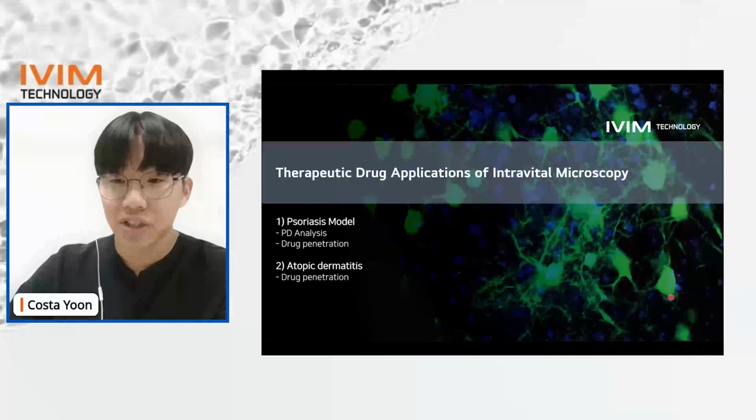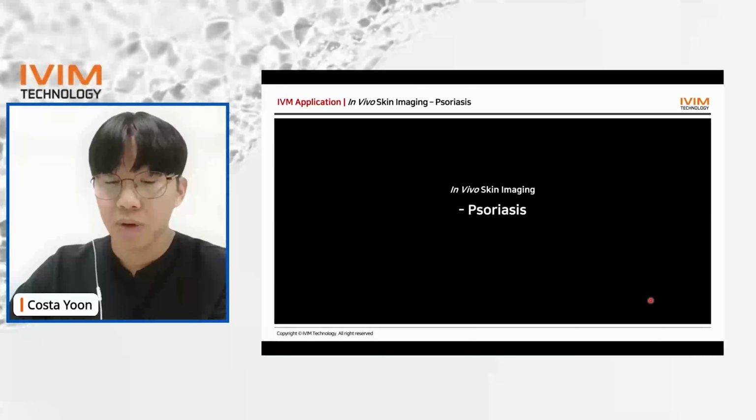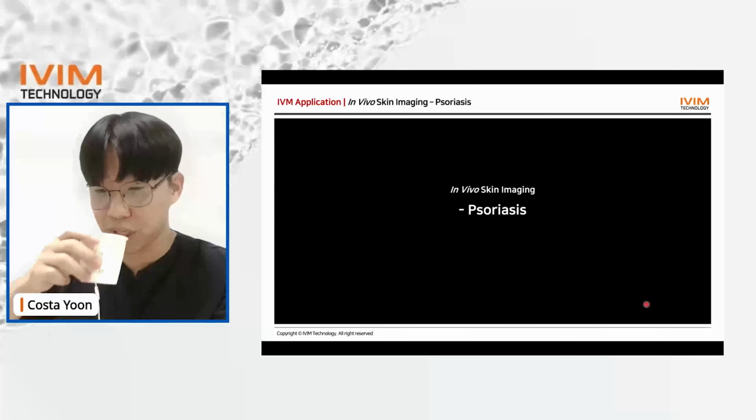Next, I'd like to present several application cases of our platform. This includes PK and PD analysis in mouse models of psoriasis and atopic dermatitis, two representative immunodermatological diseases. I will first present the PK and PD analysis performed in a psoriasis mouse model.